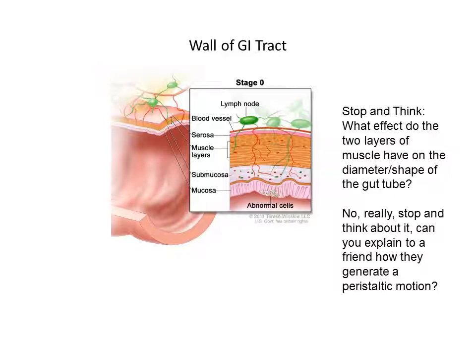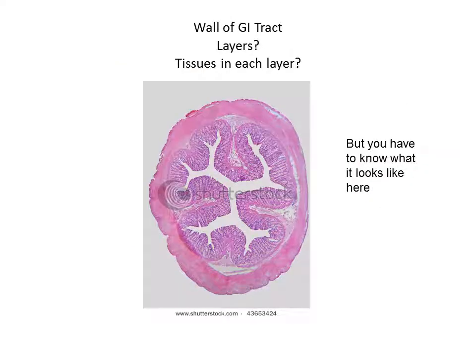But there are two layers of muscle there. They are smooth muscle, and it's called the muscularis again. On the outside there is a squamous epithelium called the serosa, and that is to protect the whole integrated organ/tissue. In our book there's one other layer called the lumen, and that's just the biological space inside of the gut tube. Again, you have to be able to look at the layers here and identify, based on the characteristics that you see, whether it's staining density or color or just their arrangement, density if I didn't say it, and so forth.